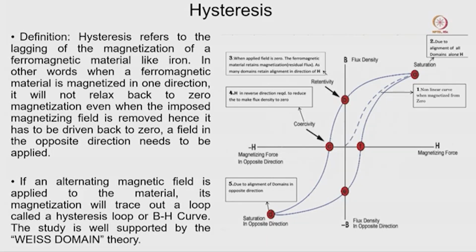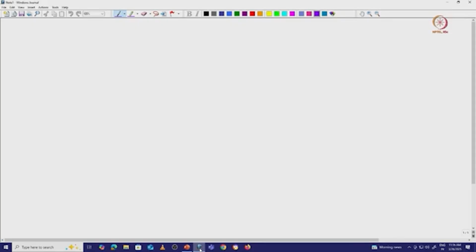One more thing that I have to discuss a little bit is the lens hysteresis. You don't have to go through each and every detail. Only remember one thing: whenever we are working with soft iron, it has some kind of magnetic flux, and it will stay there. If we have a lens where we use a very strong magnetic field, and then suddenly use the same metal with a very low magnetic field, in both cases it cannot behave in the same way. If we are using a very strong magnetic field, some of this information is stored in the metal, which will not follow the same pathway and will not come back to the same position. That is a problem, and that is called the magnetic hysteresis of the lens.